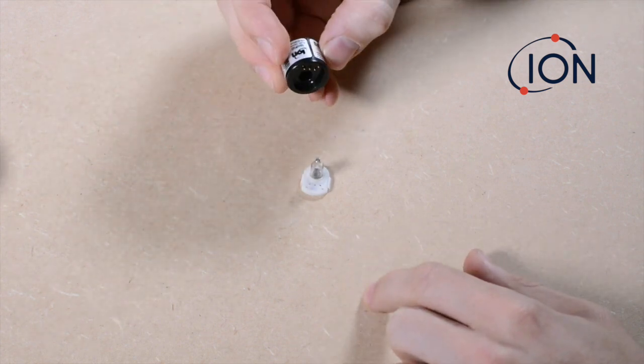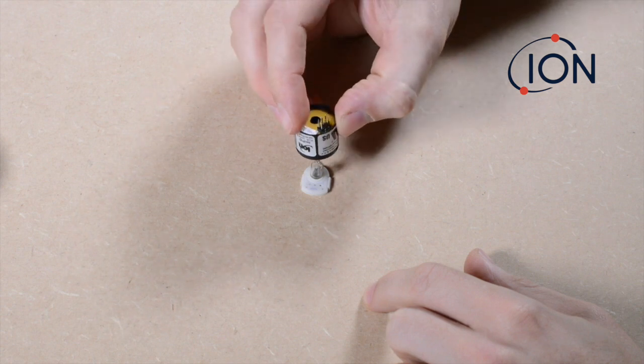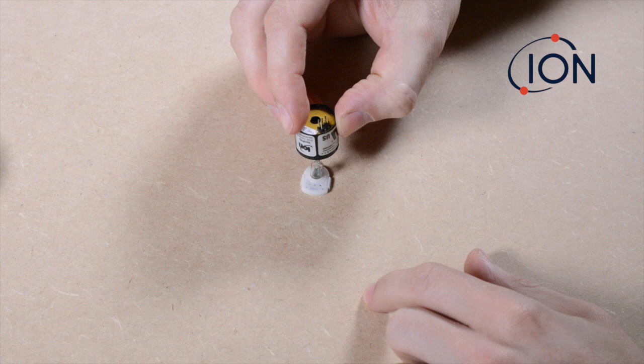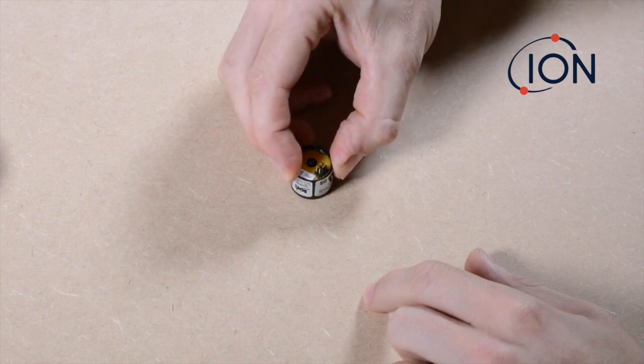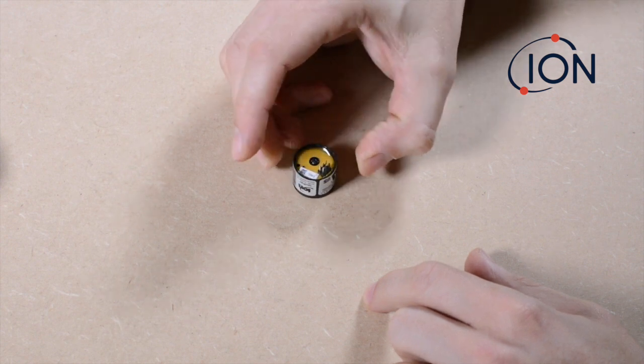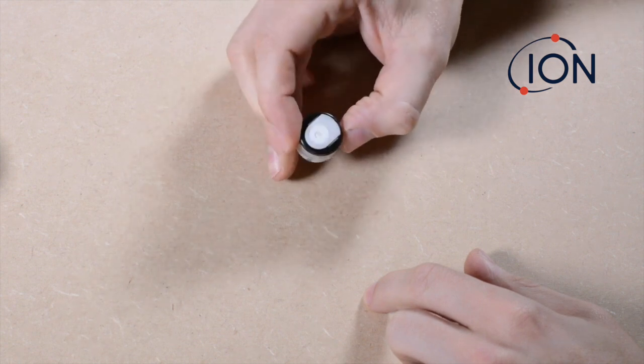Then, position the mini-PID so that the space in which the lamp sits is aligned directly above the electrode stack and lamp in the correct orientation. Push directly downwards until you hear two faint clicks. The mini-PID is now assembled and ready for use.